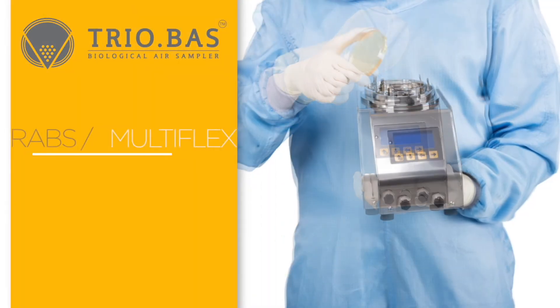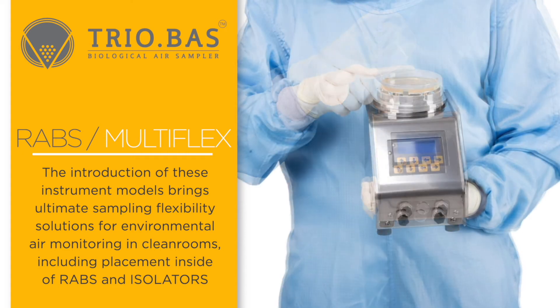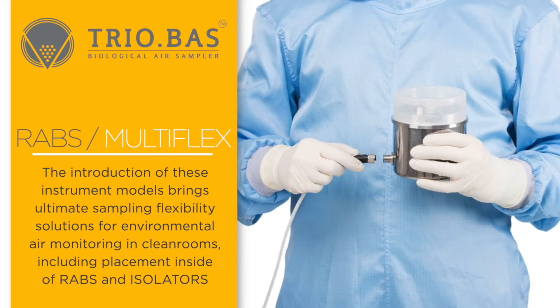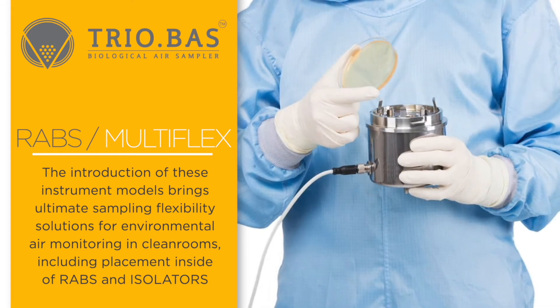The introduction of these instrument models brings ultimate sampling flexibility solutions for environmental air monitoring in clean rooms, including the option of placement inside of RABS and isolators.